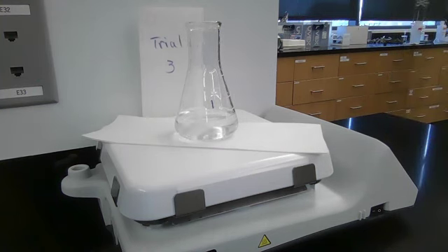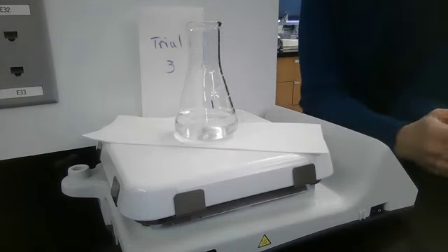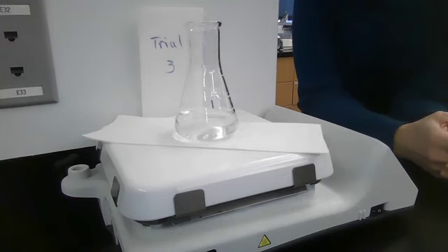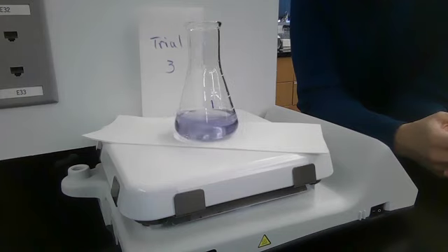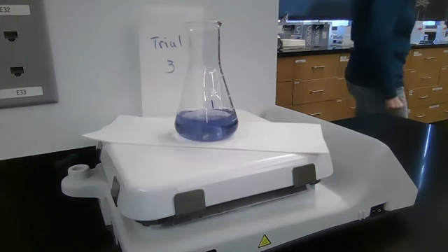I wonder, you want to see when you think the tint first starts, and see if the camera picks it up at that same time. Okay. Is this supposed to be longer? I'm seeing it. Yeah, there, that came in pretty quickly, didn't it? Yes, it did. All right, you should have stopped your stopwatch at the very first hint of color.